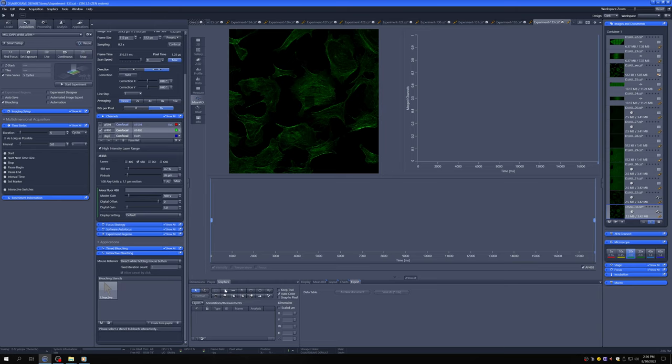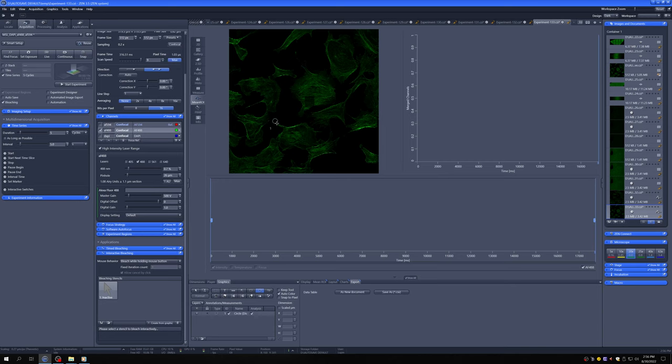So this is useful if you have, say, a cell that's moving, and by the time you set it up and start the experiment, it moved outside of the region that you wanted to bleach. So let's say these cells were alive and I wanted to bleach only tips like that.